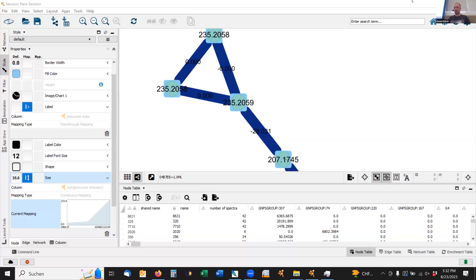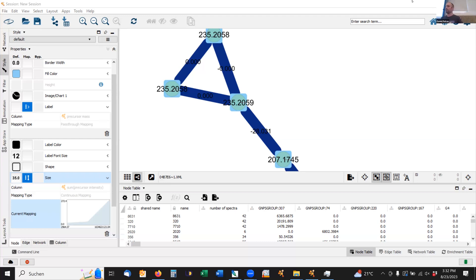All right, welcome back to our Cytoscape hands-on, which we will soon transition into the working in groups session. I had one very good question during the break which I wanted to share with all of you, and that is how to use the bypass function.